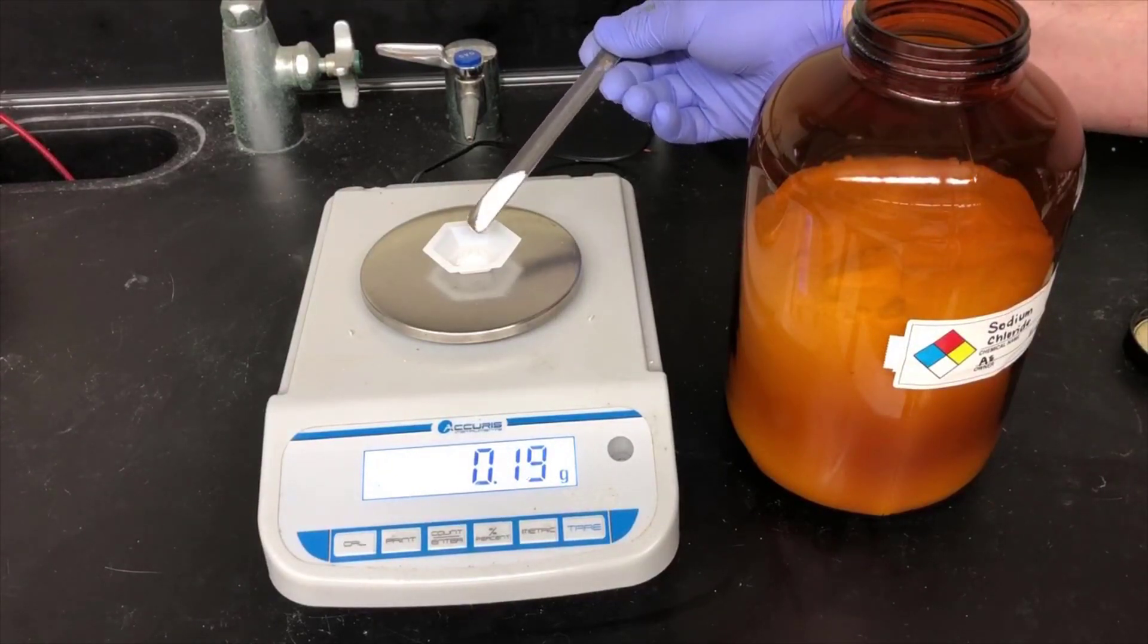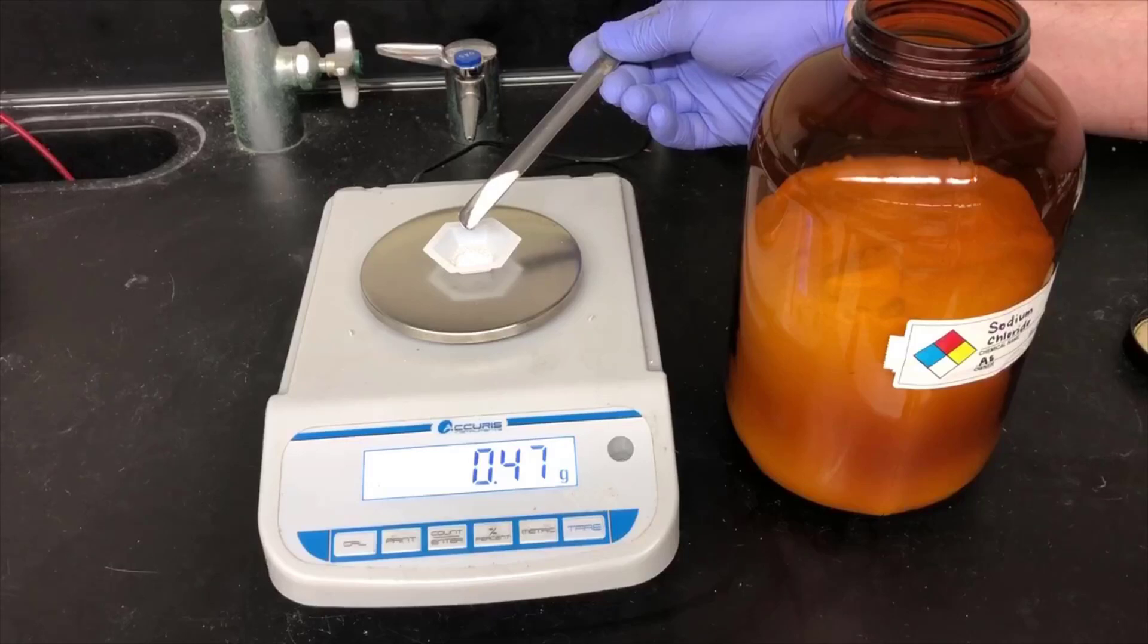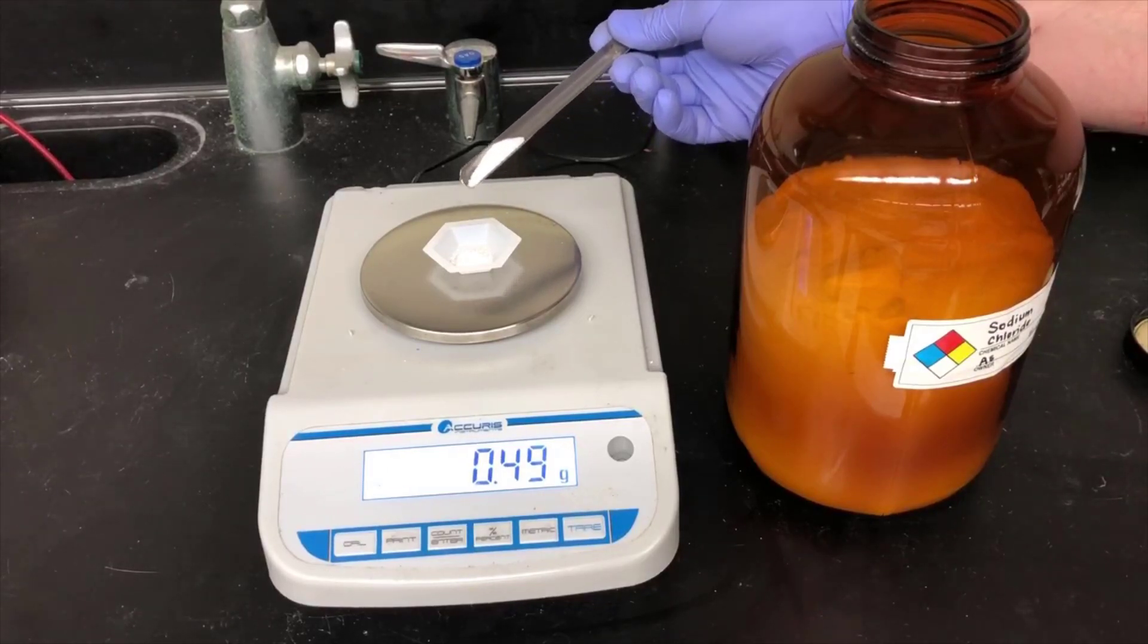The idea with adding salt is it'll make the water layer salty. That does two things. First of all, the salty water is a lot more dense, and it'll help settle the water layer out and away from the cyclohexanone layer. Secondly, it makes the cyclohexanone a lot less soluble in the water, so we're less likely to lose cyclohexanone in the water layer.